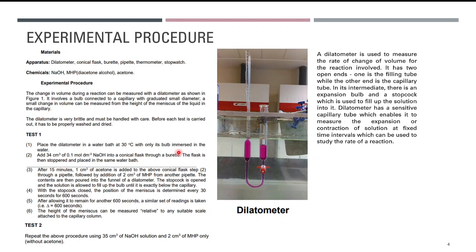So this is a relatively simple experiment. The idea is to check whether the addition of acetone is going to affect the rate of this reaction, this dissociative constant.